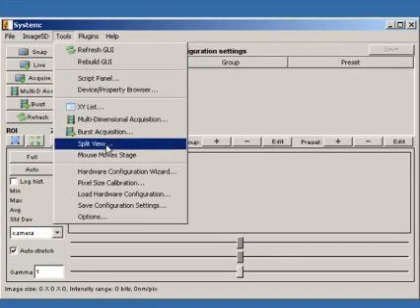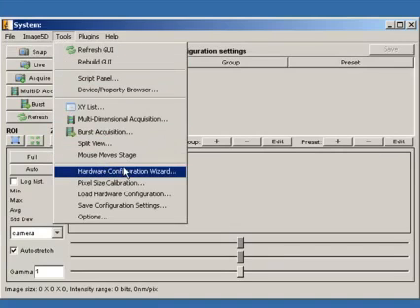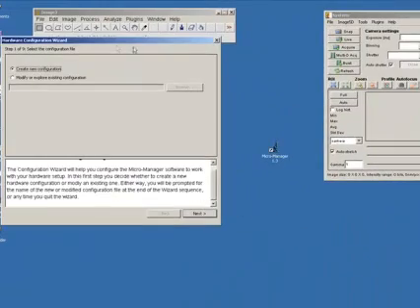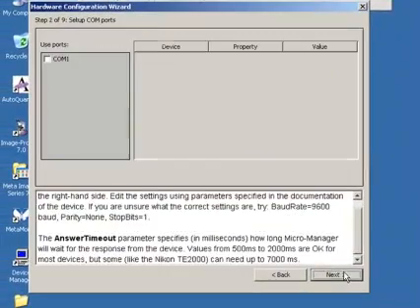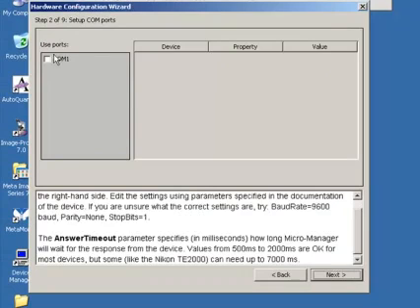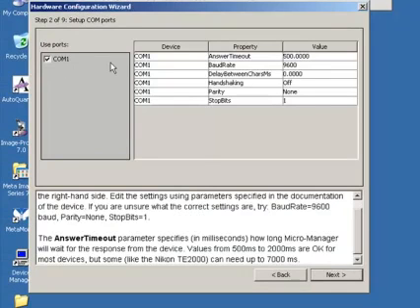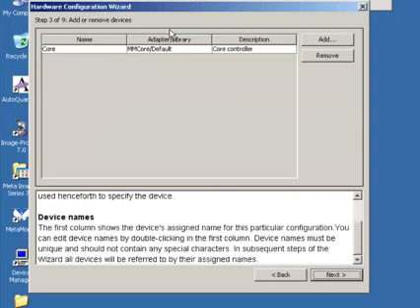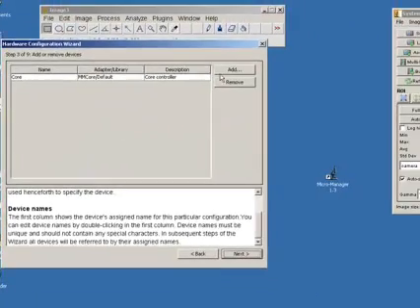If you come to the tools tab, you've got the hardware configuration wizard and this is where we're going to define all the various different components we've got on the system here. So, I'm going to create a new configuration and if I tick COM port 1 here, this is what I've got the ProScan plugged into. And if you come in here, this is where we add all the different devices we're going to look to control.